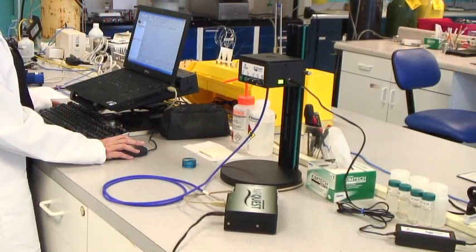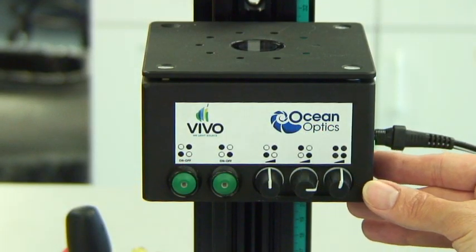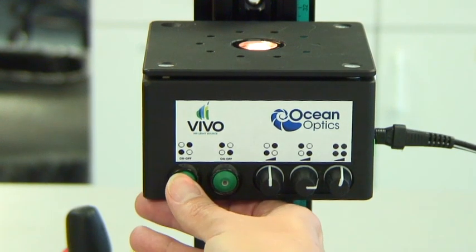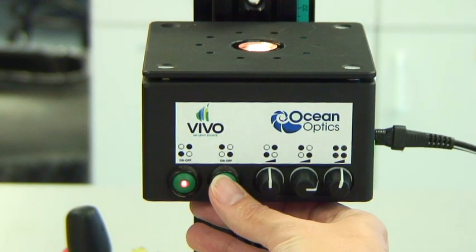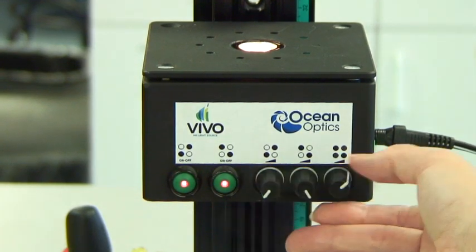Vivo features four tungsten halogen bulbs under a 90-degree angle from your optical fiber that can be turned on or off individually. Vivo also features active cooling that reduces the risk of overheating your sample, ensuring accuracy every time.